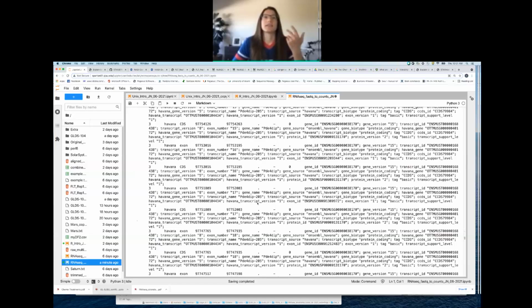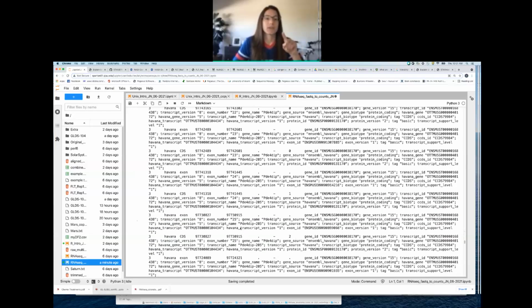Okay, and you can see, yeah, a ton of repeats. So this is another thing I want you to make a mental note of. If you notice on the GTF file, we have several lines that represent the same gene and the same transcript of that gene, right? So we have duplicates here. We will be sorting through and removing any duplicates that are due to having duplicates in the GTF file. That's part of the filtering step that Lauren's going to go through with you.